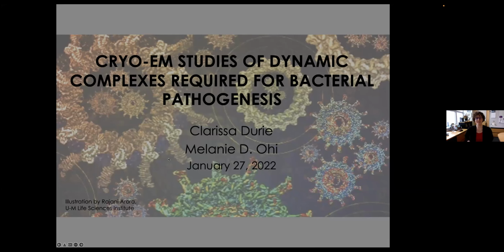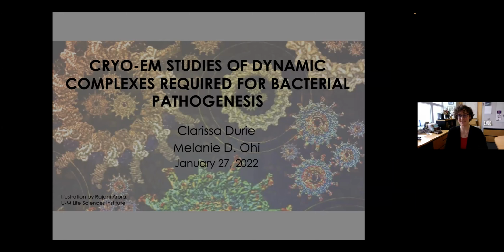Okay, so Clarissa and I are going to tag team today. I'm going to give a little bit of background about how we got into studying these really large dynamic complexes that we're purifying from bacterial pathogens. And then she's going to go into more of the detail about all the tips and tricks that she used to actually push the resolution of the Legionella complex so that we could build molecular models and figure out how this complex fits together.